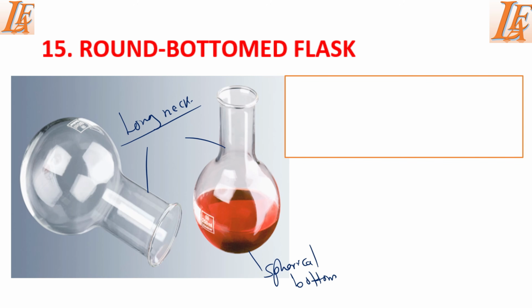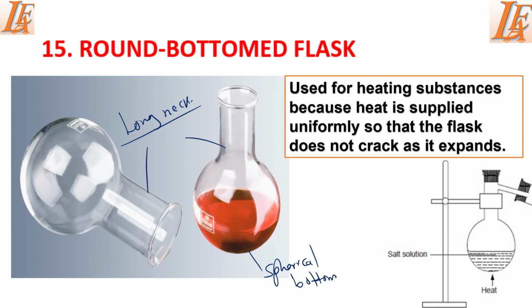Remember, this flask is made of glass, and glass is a poor conductor of heat. Therefore, if heat is not distributed on a large area, it will be concentrated at one point, making it crack. So this instrument is used in heating substances, and this is because heat is supplied uniformly so that the flask does not crack as it expands.